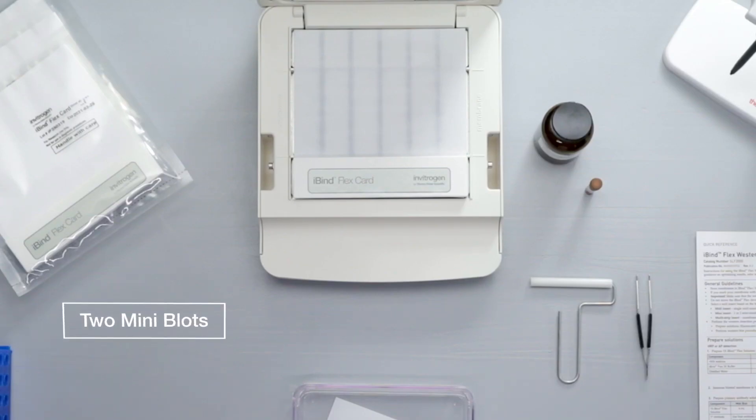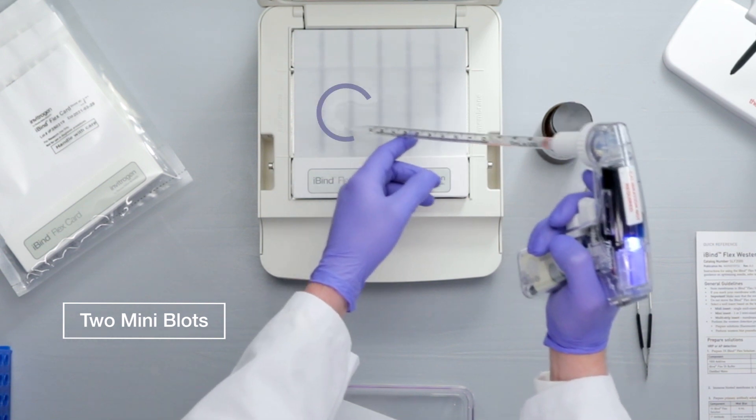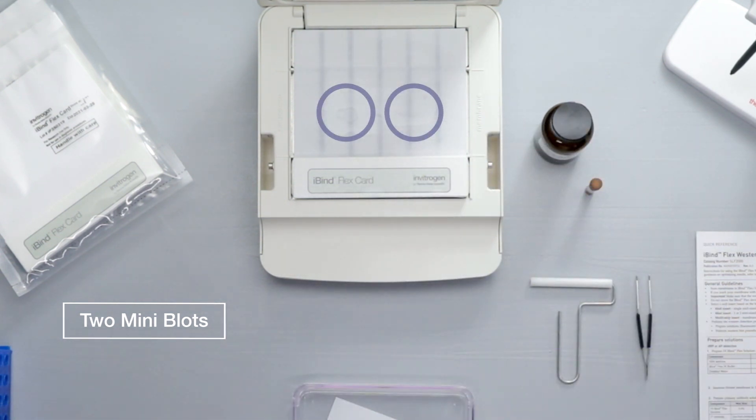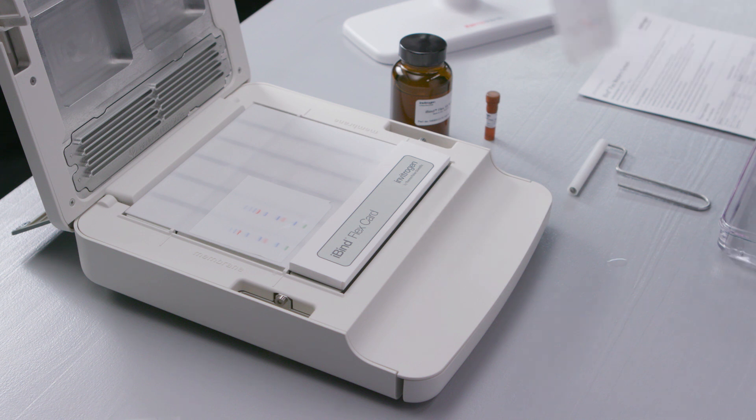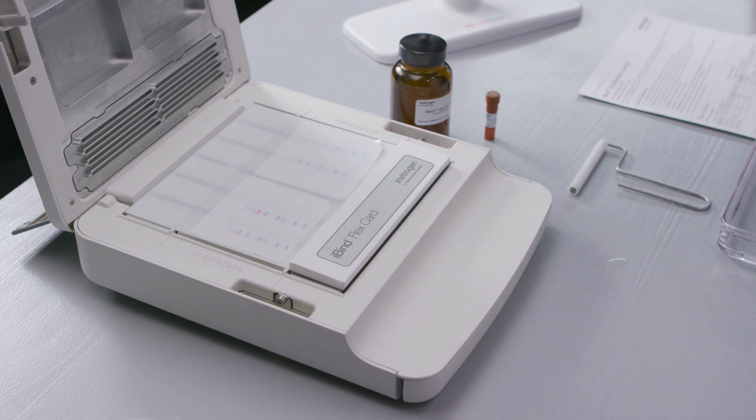To process up to 2 mini blots, first make sure the mini well insert is installed. Then add an additional 1 milliliter of 1X iBind Flex solution per blot to the card, allowing it to pool. For mini sized blots, use the center alignment guide to place your blots on either side.